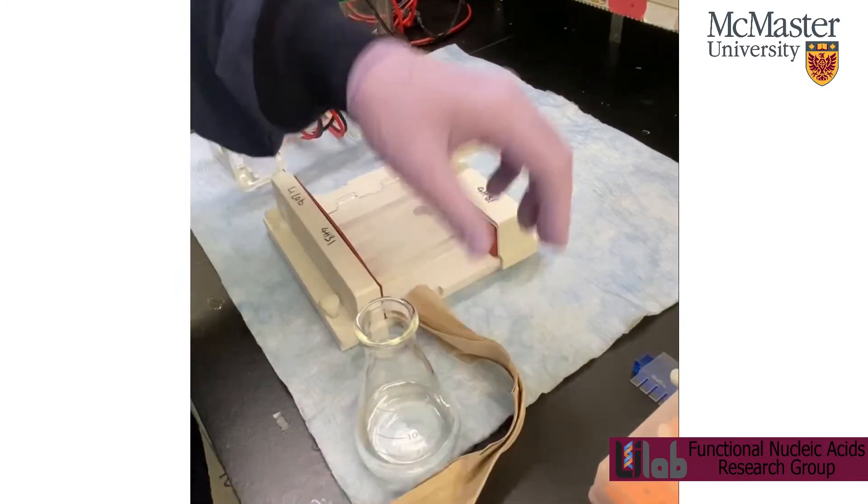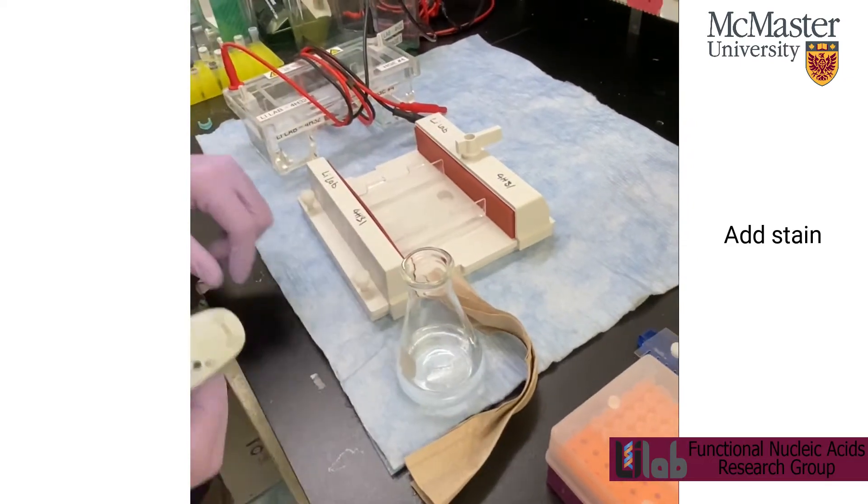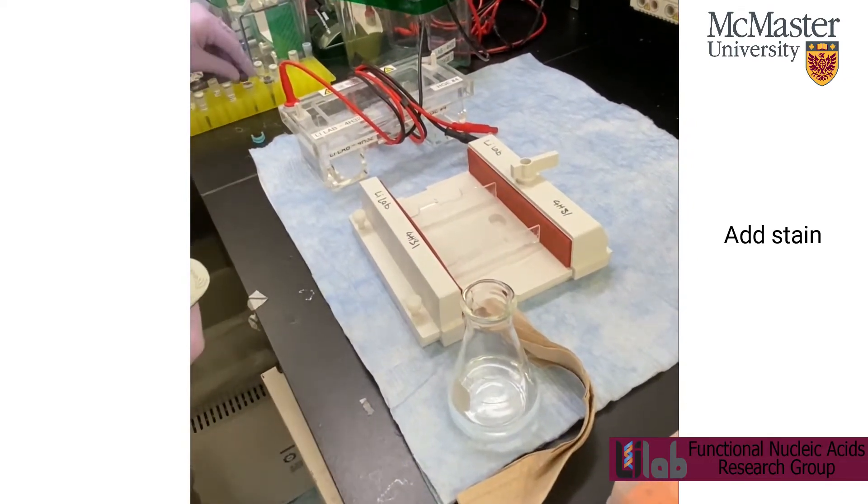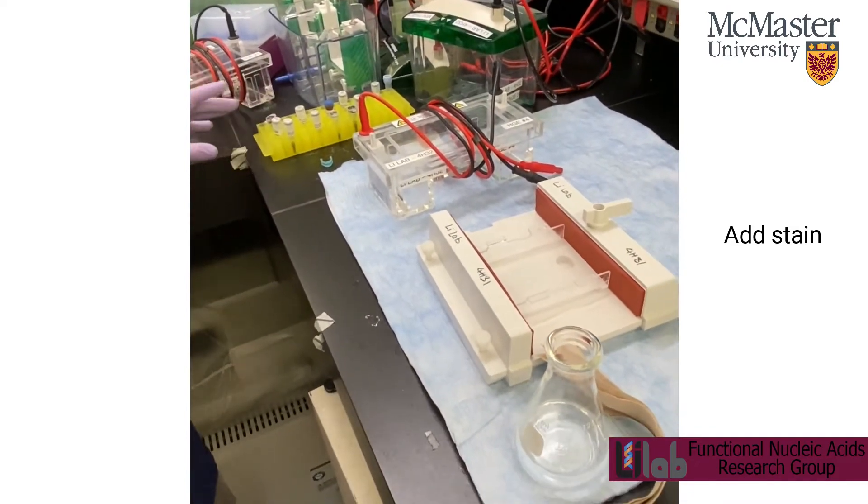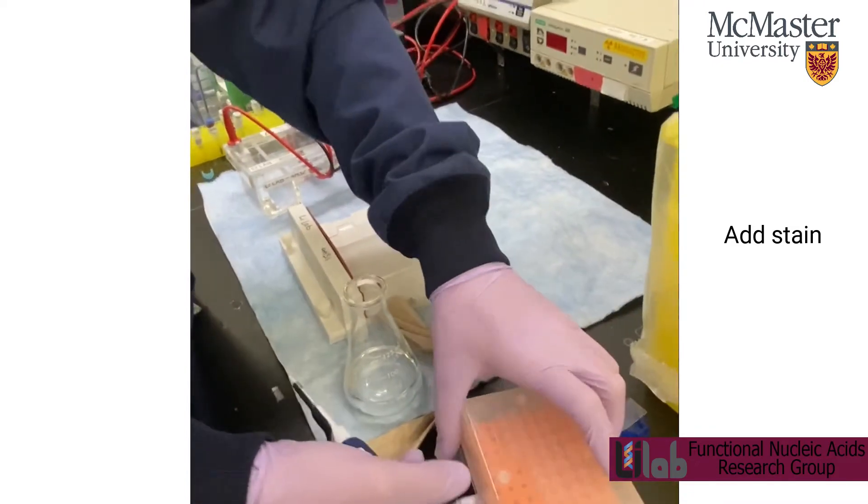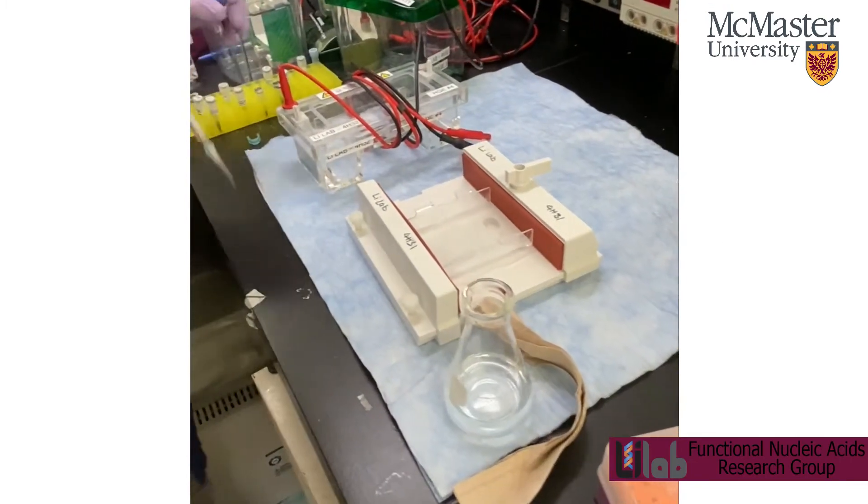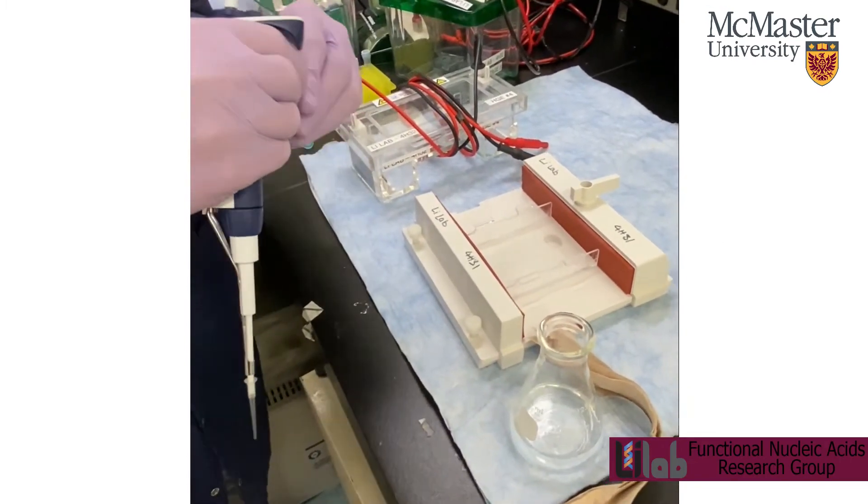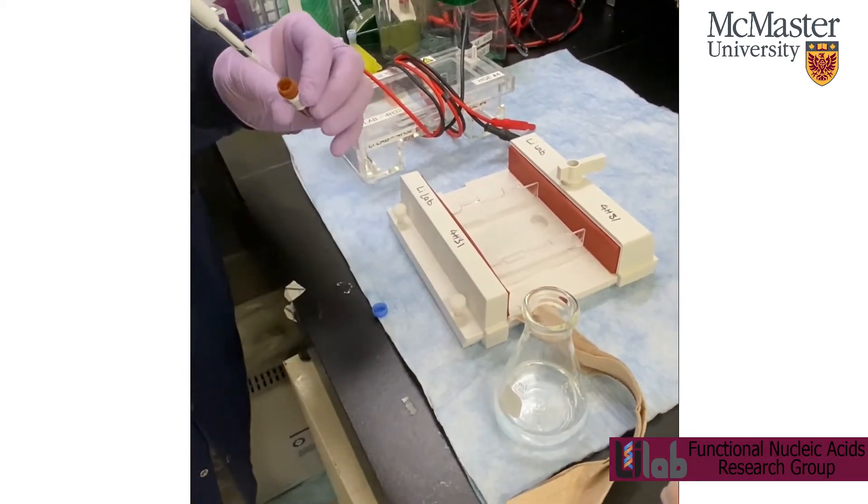And then you can mix your stain in the glass. So you can use CyberSafe. That's just in this tube rack here. So it's 10,000 times concentrated. So to get to one times, I'm just going to add five microliters because my volume is 50 mils.